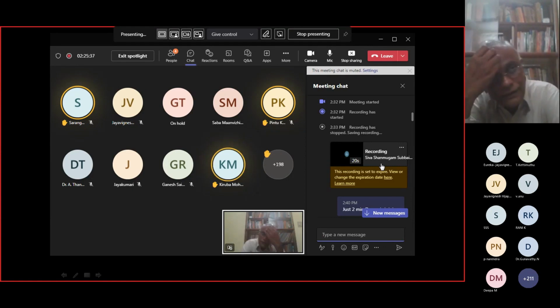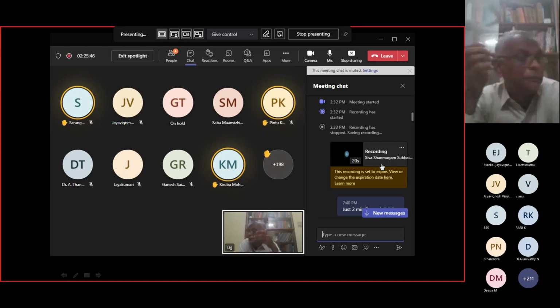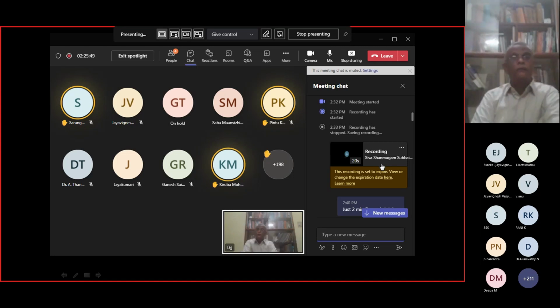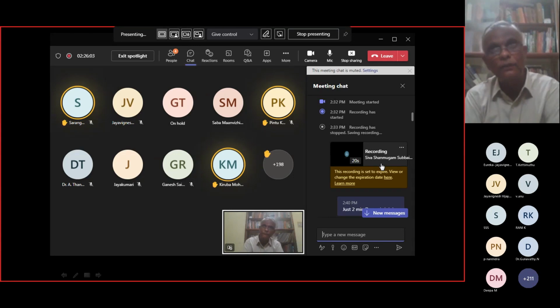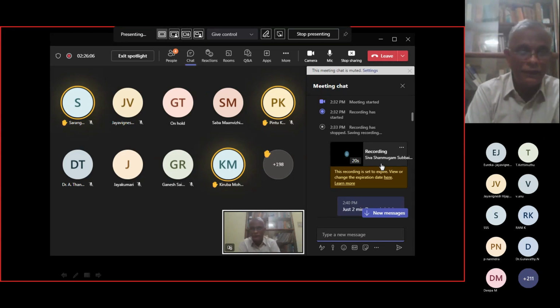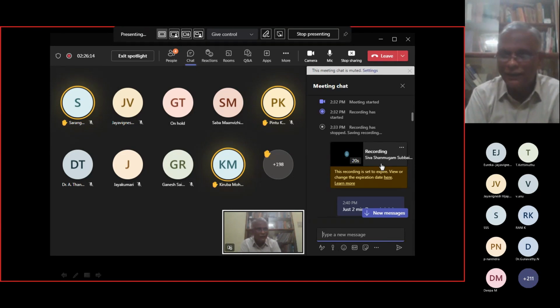Yes. This is a typical situation which I came across a while ago. We applied for our laboratory to get recognized under DSIR as an industrial research laboratory, and we were denied that status by the DST, Department of Science and Technology, saying that you don't have the HPLC. Then I asked the panel members questions, and I explained that HPLC is in no way better than TLC, and till the end they did not accept. So I didn't pursue it further.